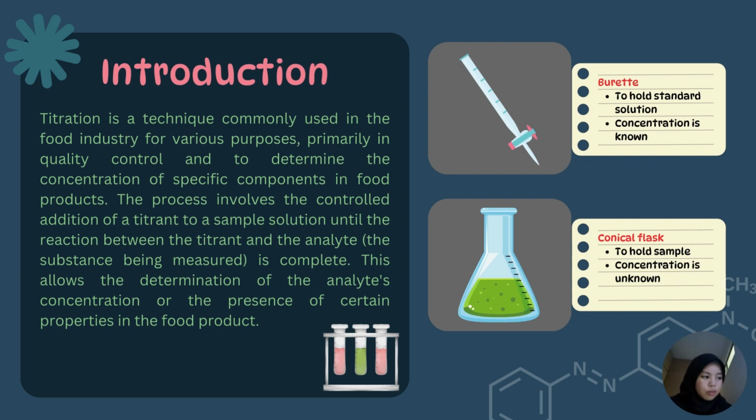There are two pictures that we can see on this slide. The first one is the burette and the second one is the conical flask. The burette holds the standard solution of known concentration, and the conical flask holds the sample that we don't know the concentration of.